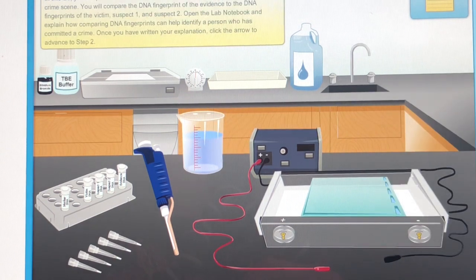In this lab, you will produce a DNA fingerprint from cells on a strand of hair found at a crime scene. You will compare the DNA fingerprint of the evidence to the DNA fingerprints of the victim, Suspect 1 and Suspect 2. Open the lab notebook and explain how comparing DNA fingerprints can help identify a person who has committed a crime. Once you have written your explanation, click the arrow to advance to step 2.